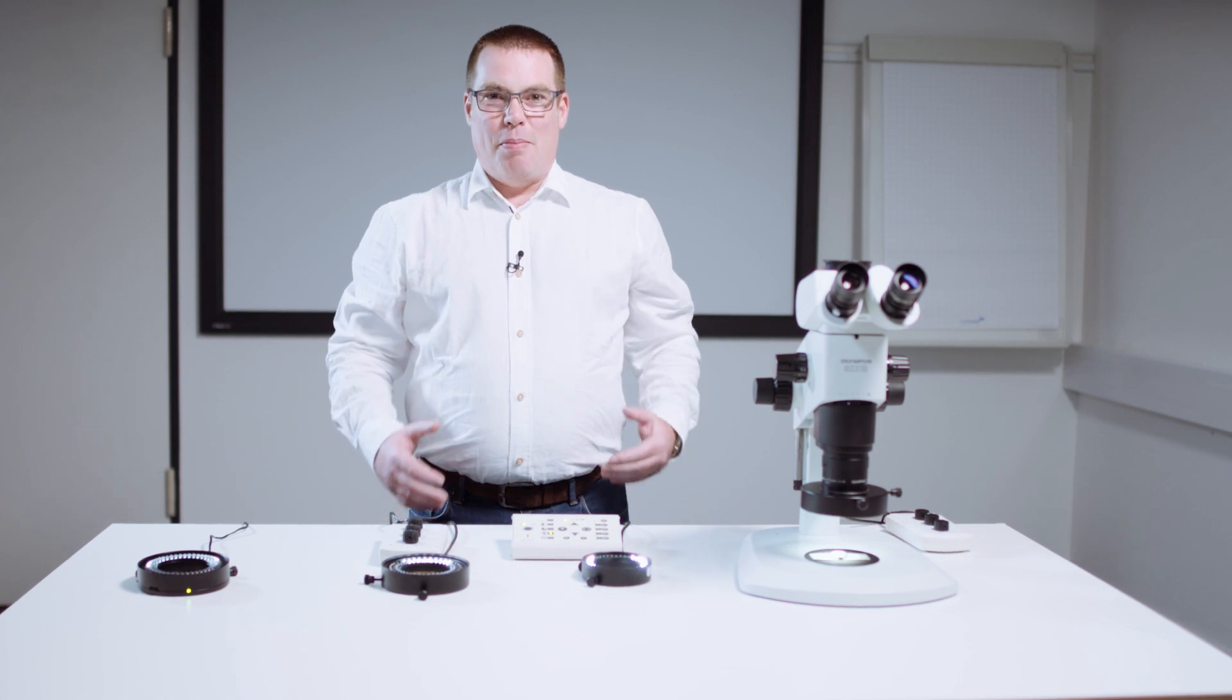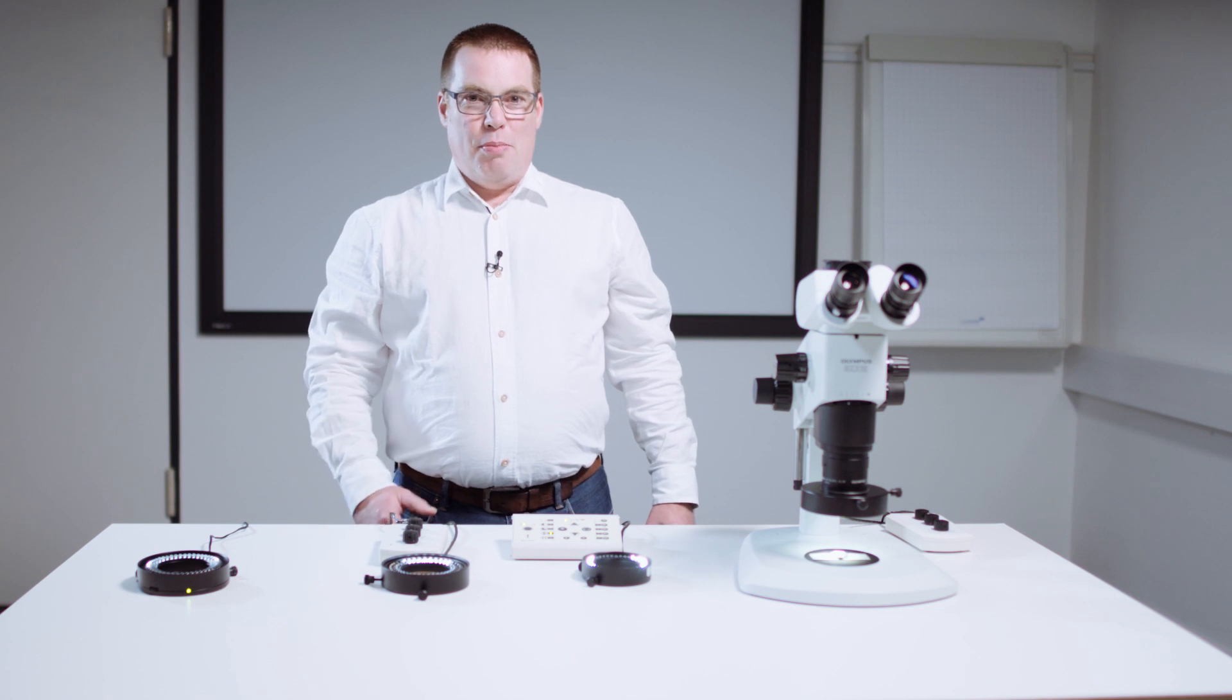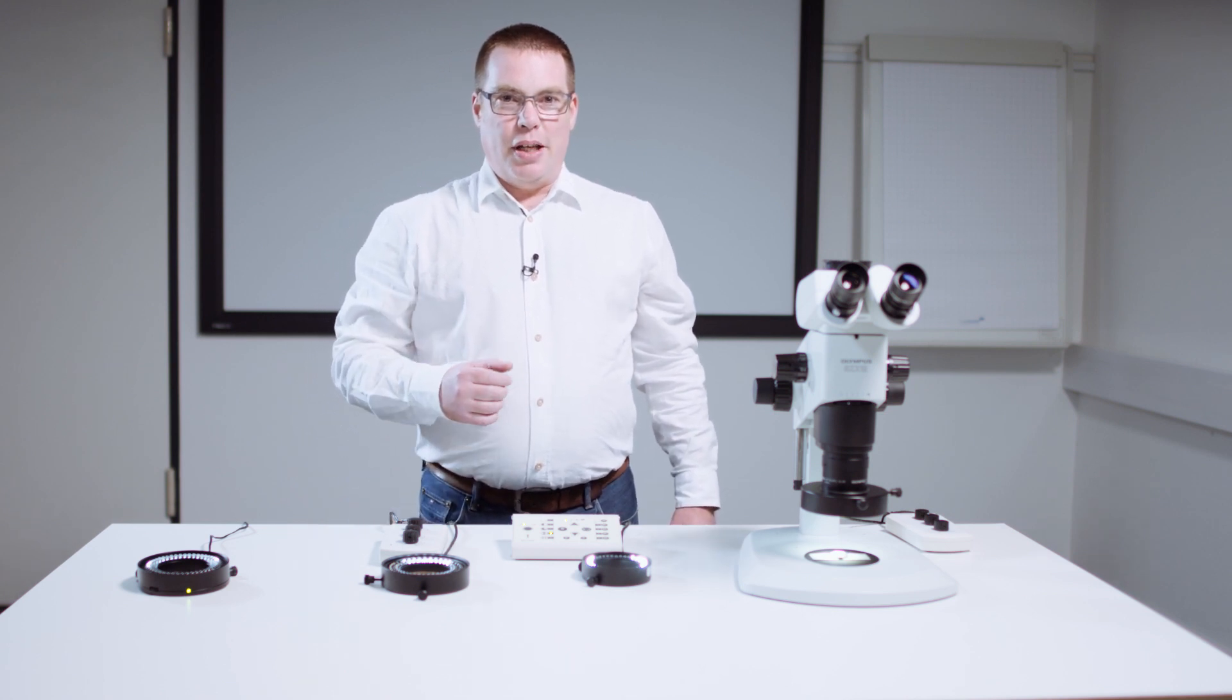Welcome to Schott Microscopy. My name is Christian Zaber. Today I would like to introduce you to contrasting using different segment modes on an LED ring light.